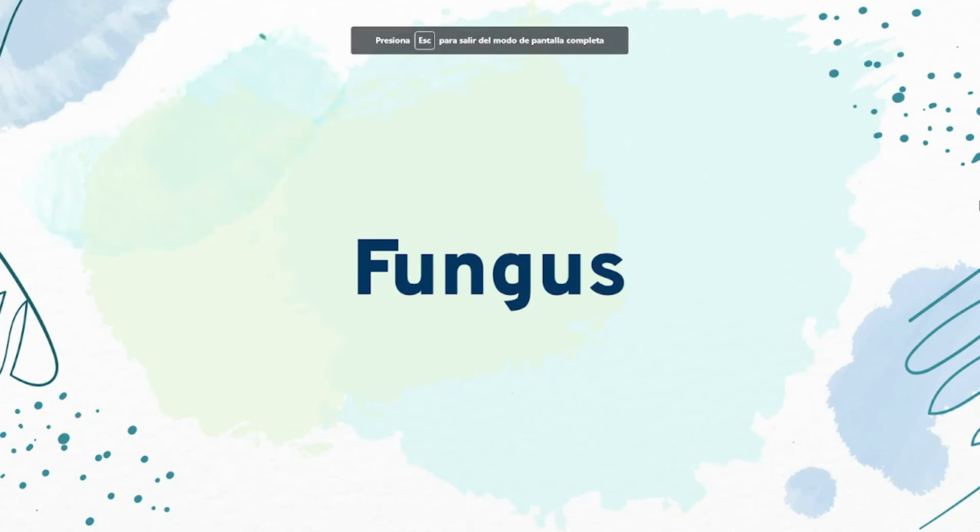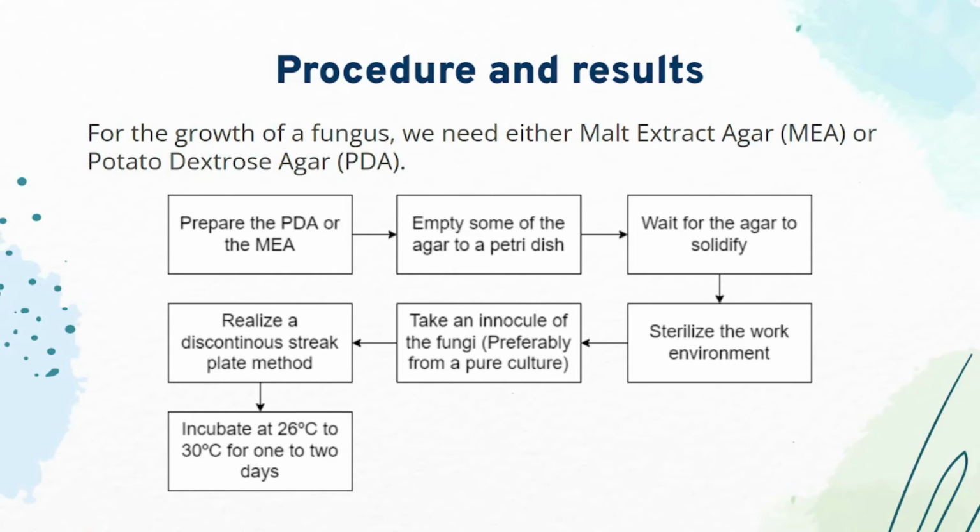Now we proceed to the presentation of the fungus. First of all, the procedure results. For the growth of a fungus, we need either malt extract agar or potato dextrose agar. We can select either of those. First, we prepare either the PDA or MEA. We empty some of the agar into a petri dish. We wait for it to solidify. Then we sterilize the work environment.